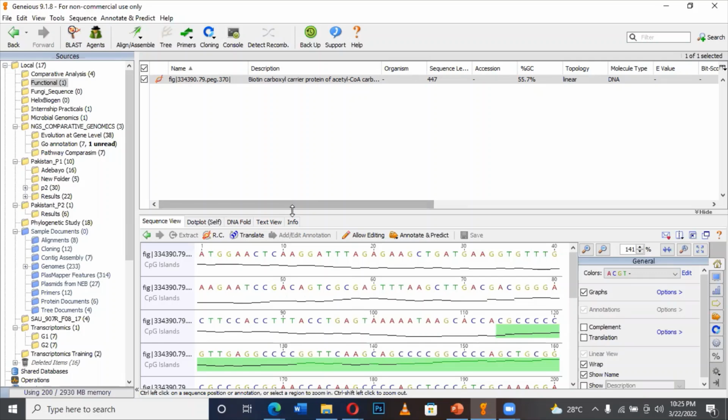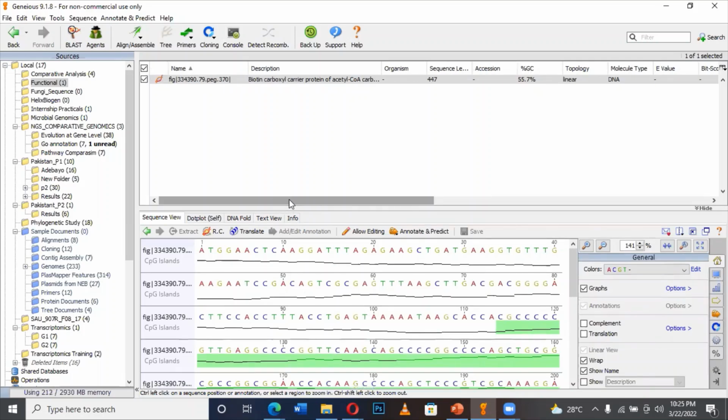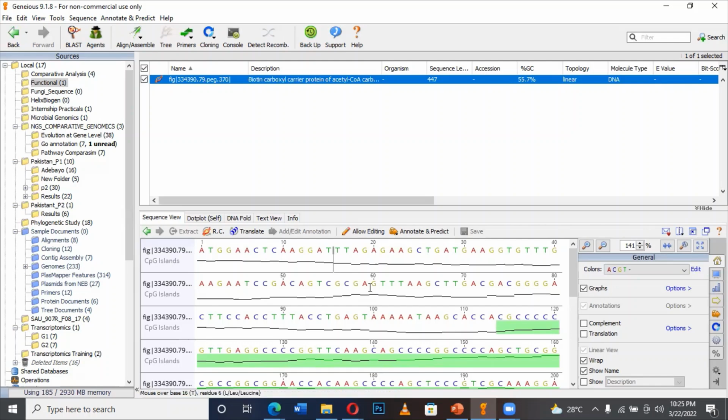analysis, trying to understand mutation that might exist within this particular genome, that a particular chemical compound was applied to, and a control. So you get this particular gene, once you did annotation for the control and you did annotation for the one you applied a chemical or a compound to, all right, try to see the effect of the chemical compound, drug or whatever you apply to that particular organism. And then you try to see, based on variant analysis, but that's just another research on its own.